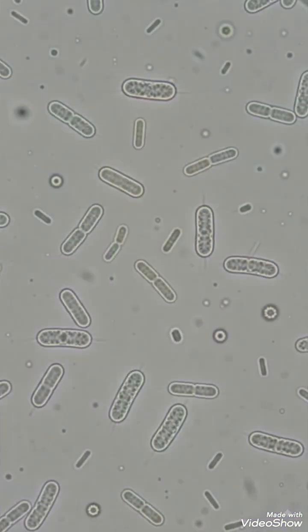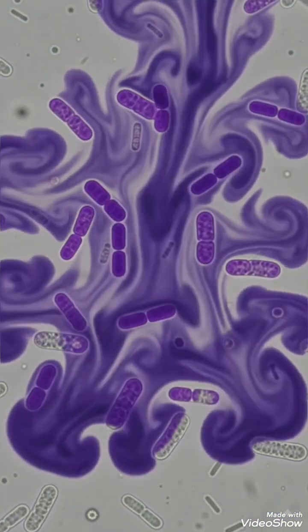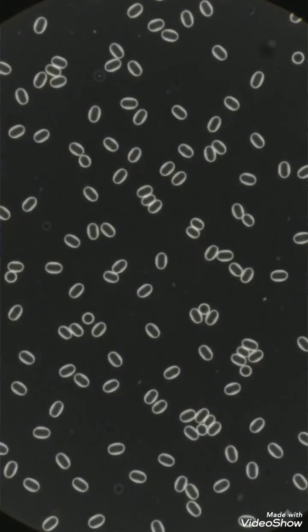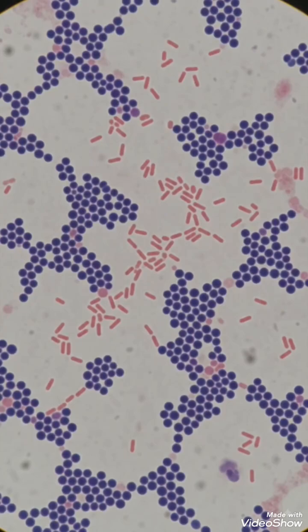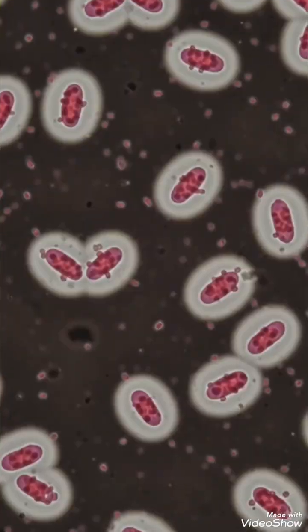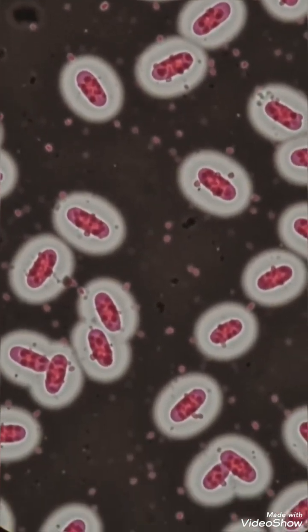Most microorganisms are colorless and transparent. Without staining, they are difficult to observe. Staining provides contrast and highlights structures. There are different types of staining techniques such as simple staining, negative staining, differential staining like gram staining and acid-fast staining. There are special staining techniques as well, such as endospore staining and capsule staining.